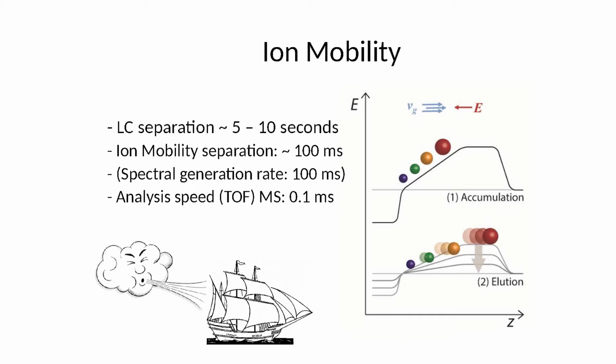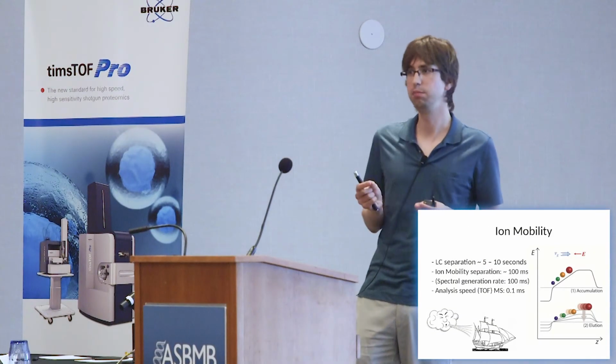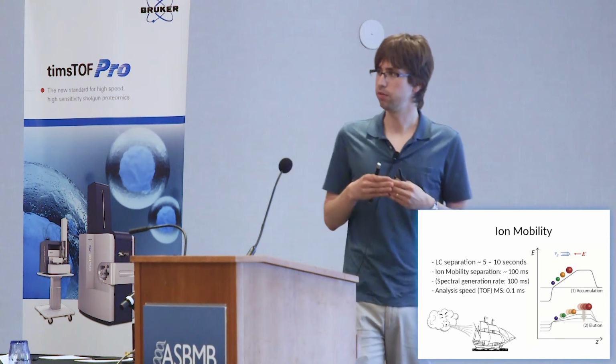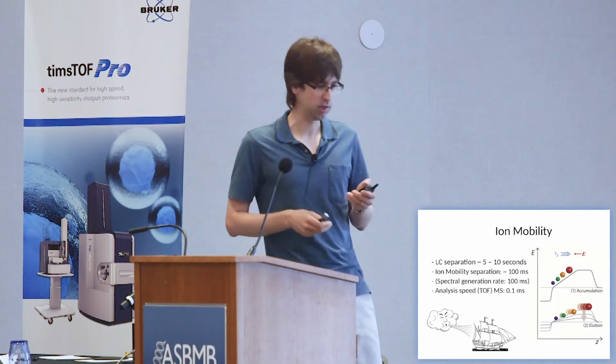And so if we perform the ion mobility separation on a timescale of 100 milliseconds, we can actually get a separation over these 1,000 individual TOF pushes. And now each individual TOF push has meaning because it's associated with an ion mobility, instead of simply the same measurement over and over again that we then average.